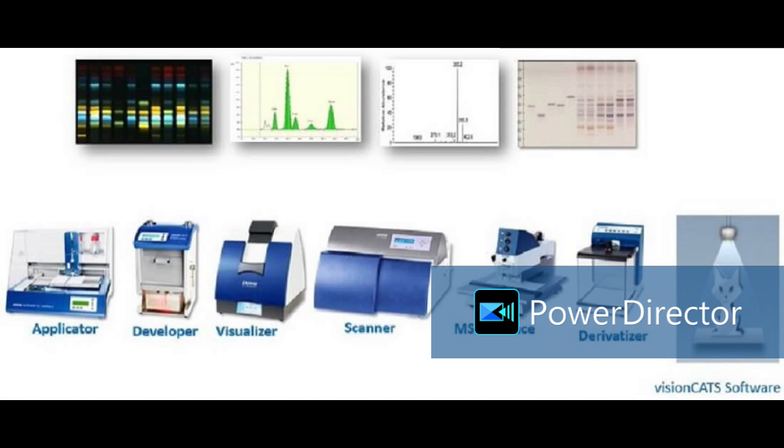You know the concept of HPTLC fingerprint. I will explain you what exactly the fingerprint is. Suppose we have applied our sample here. It is a mixture of many components, and if we run the plate in the mobile phase, the components will move up to the solvent track. So from start position to end position, this is like one track, and we can say it is the HPTLC fingerprint of this applied sample in this mobile phase under these chromatographic conditions.